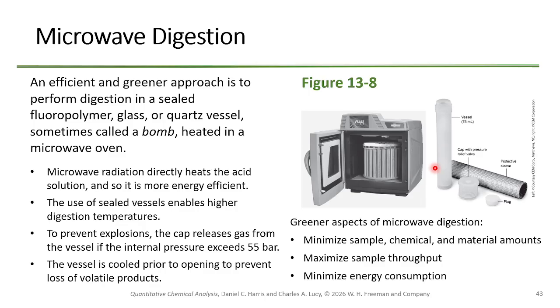The reason they're called bomb calorimeters is because originally, back after World War II, we had all these bombshells. And so we took all these bombshells that had been made and said, hey, we can use these for labs. So if you go back far enough, you literally would have bombshells from World War II being used for this stuff. They worked really well, actually, and very cheap.